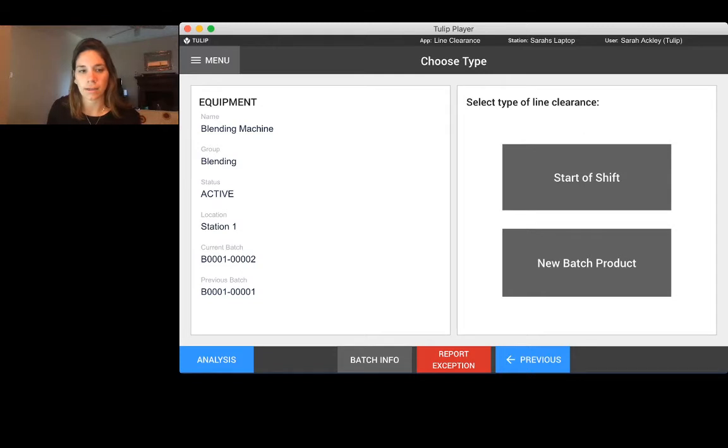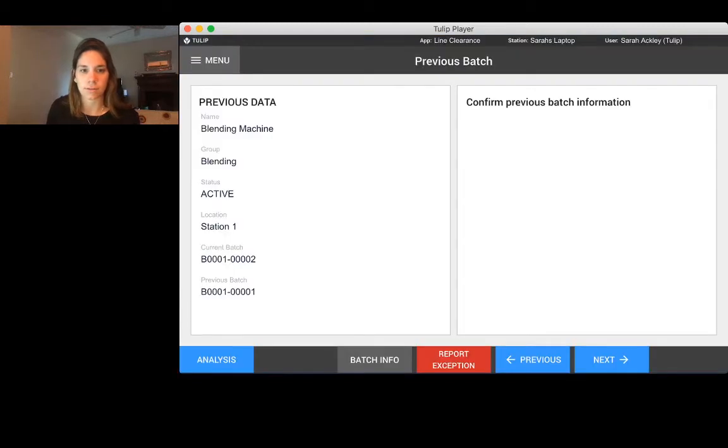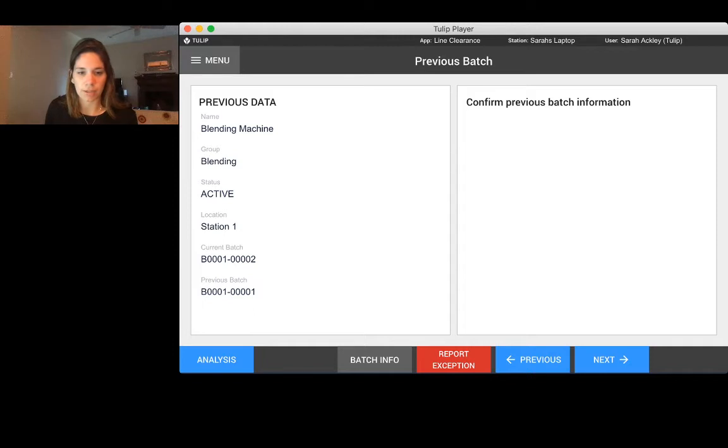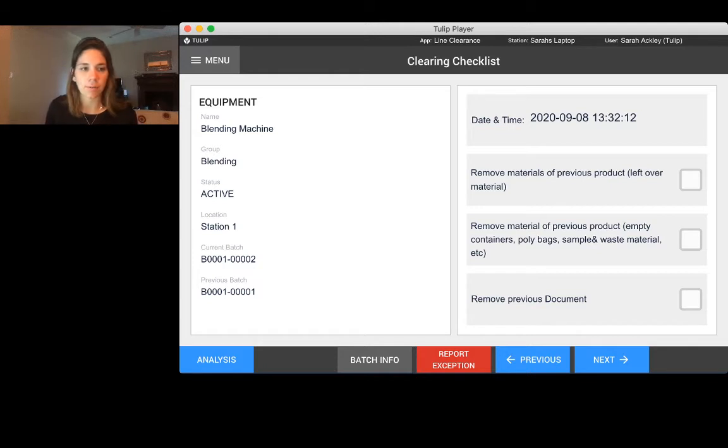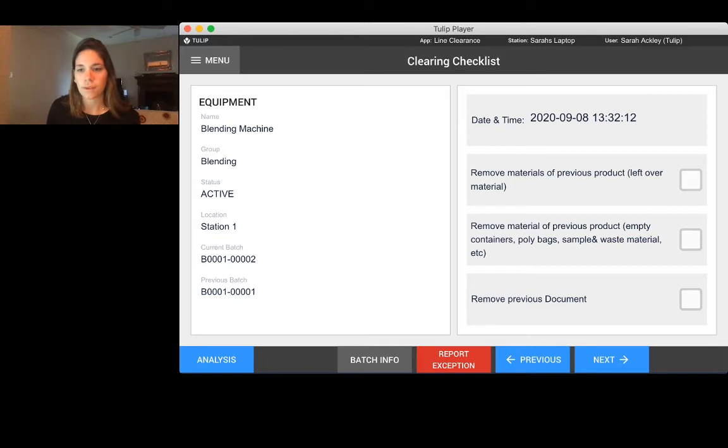We're going to go ahead and click start a new batch. Once again it's saying please confirm the previous batch information. I'm going to click next, I've confirmed it. TULIP automatically pulls the date and time of when this application has started. It's currently 1:32, so it automatically pulls that timestamp.